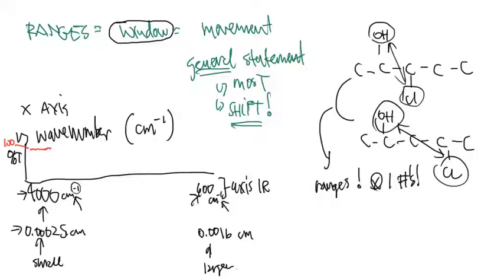All of the light goes through, nothing gets absorbed. And then there's going to be a workout day that the molecule's interested in. It goes to the gym, and it begins to stretch, and it begins to bend. When that happens, the transmittance plummets and goes down, because the molecule is now absorbing the light. Not enough light is going through as it did before.